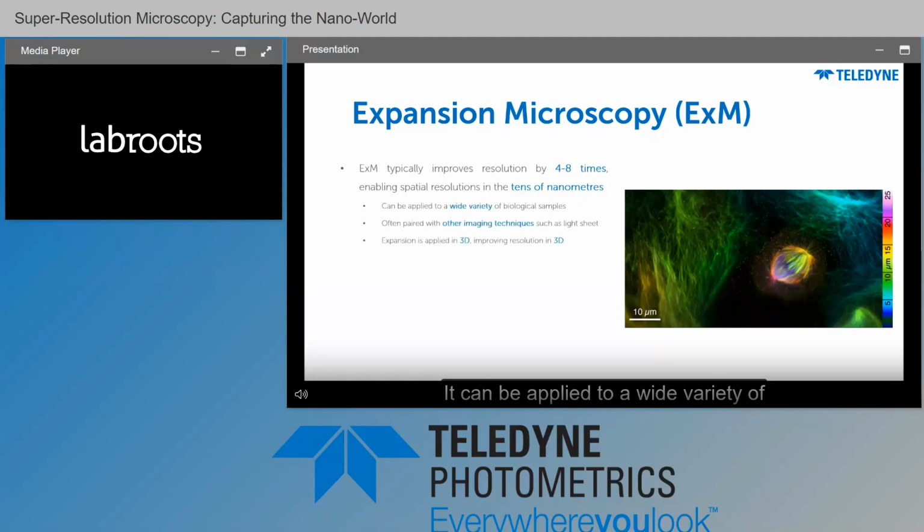It can be applied to a wide variety of biological samples, and you can pair it with other imaging techniques such as light sheet, which is well suited to large samples, because while you may not have previously had a large sample, once you've made it much bigger, you need imaging techniques that are well suited to imaging these large fields of view. And you can apply this in 3D because you've expanded the sample in 3D. It's expanded equally in all directions.